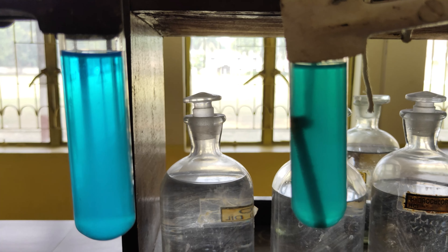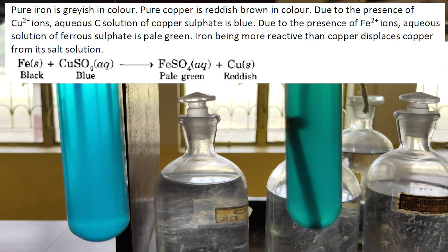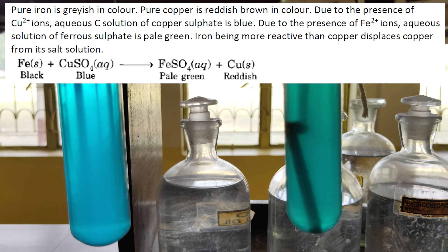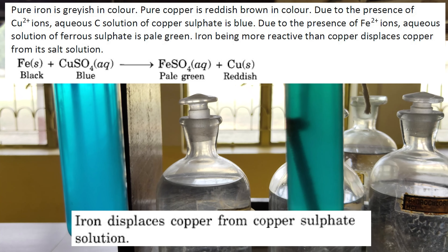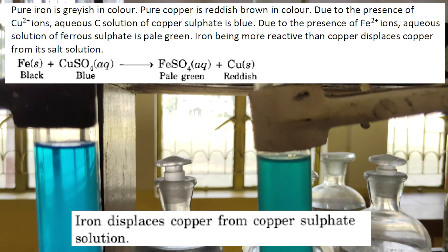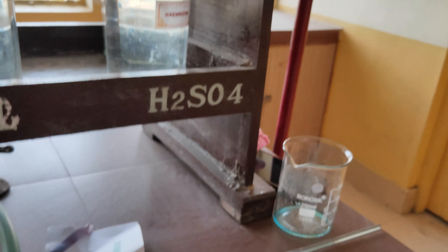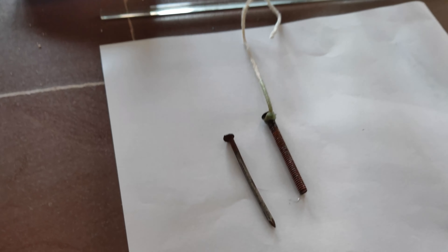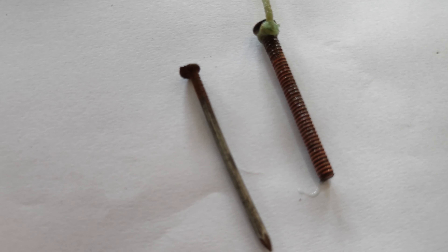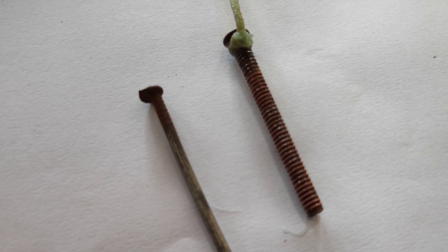After 15 minutes, the colour of the copper sulphate solution containing the iron nail turns light greenish, whereas the colour of the solution in the other test tube does not change. The greenish colour is due to the presence of iron ions. Remove the iron nail from the solution and compare it with the other nail. There is a brown coating of copper on the nail that was dipped in the copper sulphate solution, while the other nail retains its greyish colour.